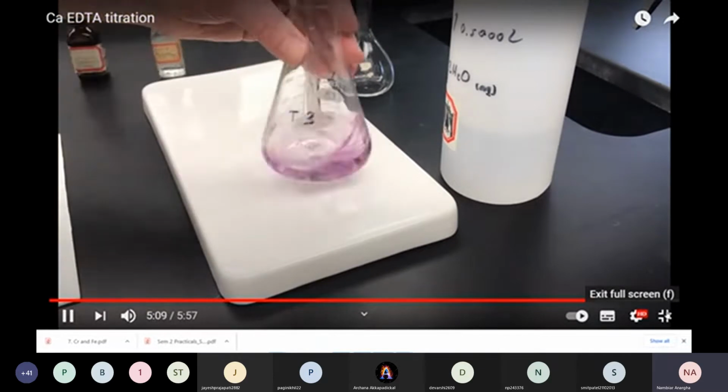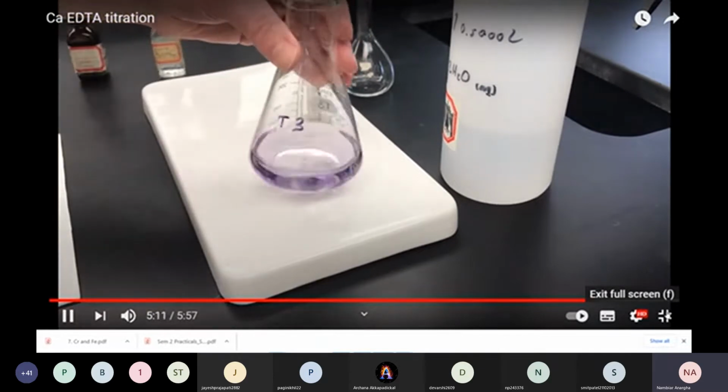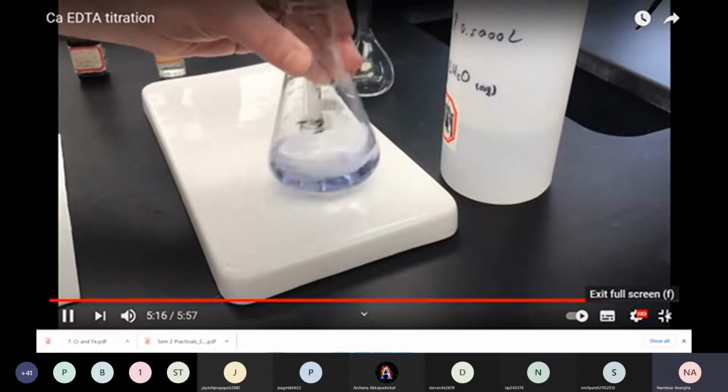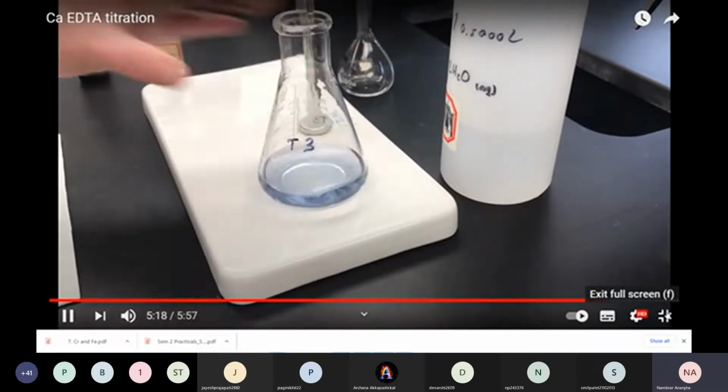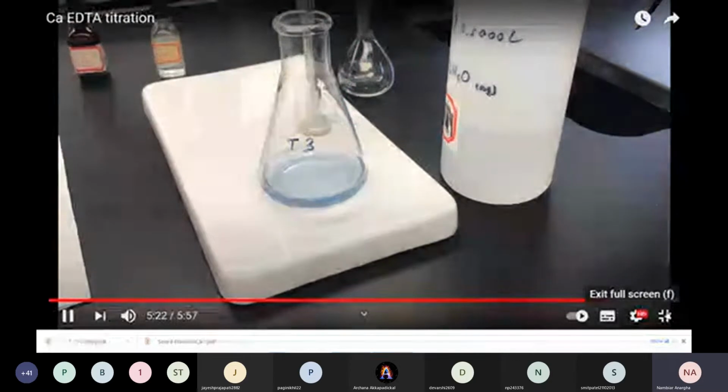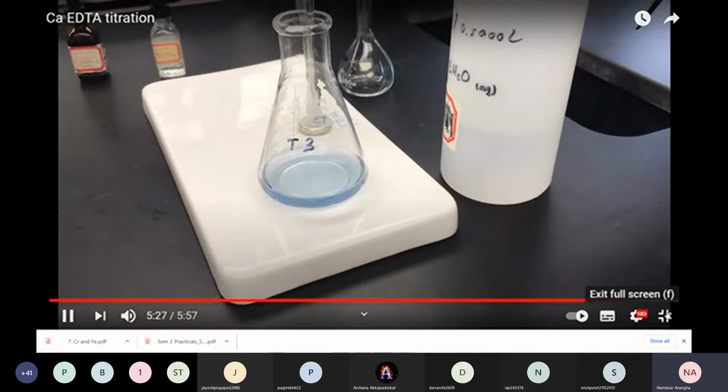There we go. You can nicely see that purple, and we'll catch that last little bit that went in. Oh, there's the blue. All right, so that's what a good endpoint looks like. We've seen how we've gone through the reddish pink, through the purple, now to what looks like almost a sky blue. So I'm going to get that last burette reading here.